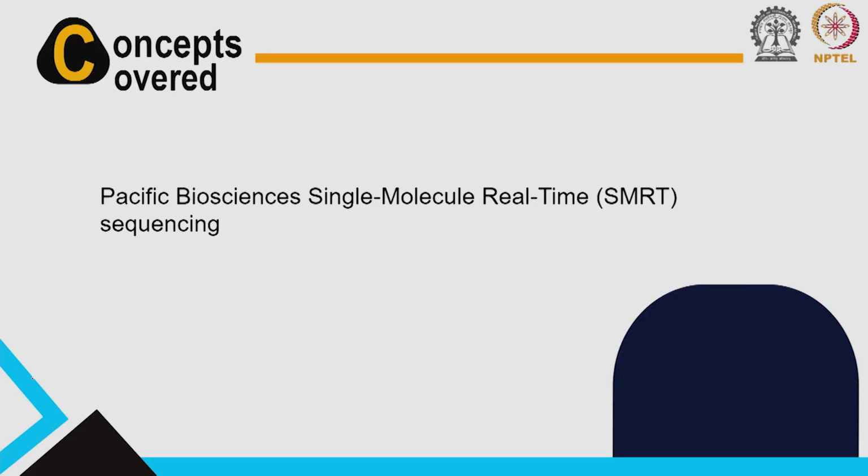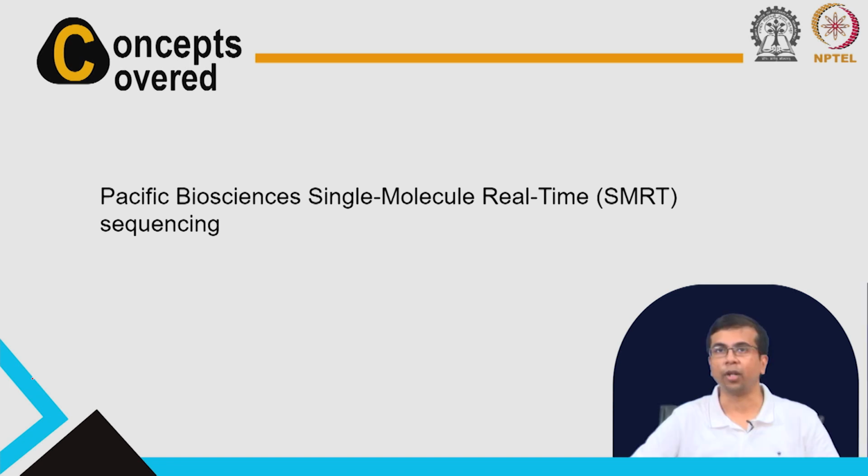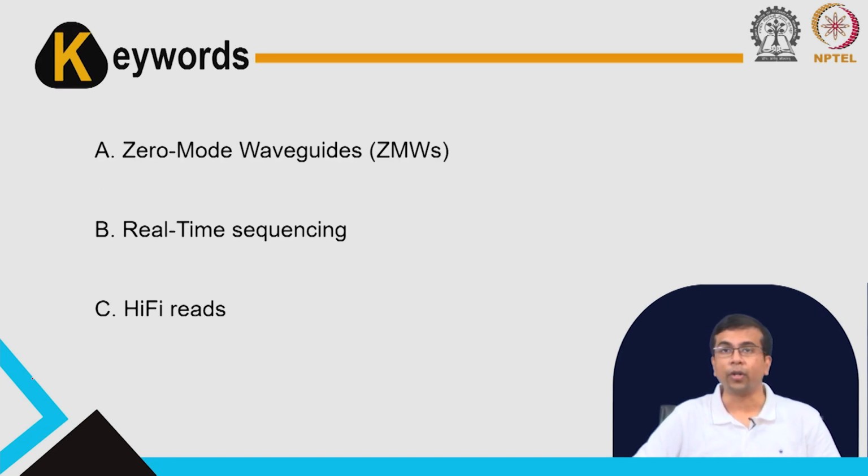So, this is the topic for today's class. We will discuss the single molecule real time sequencing method developed by Pacific Biosciences. These are the keywords that we will come across. We will have zero mode waveguides, or ZMWs, we will see the term real time sequencing quite often, and finally, we will also see something called HiFi reads in the presentation.